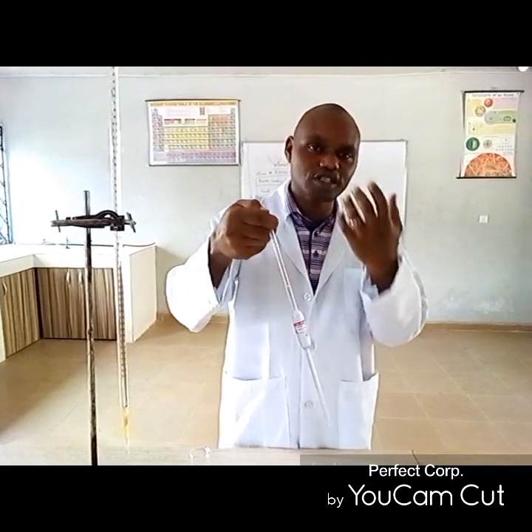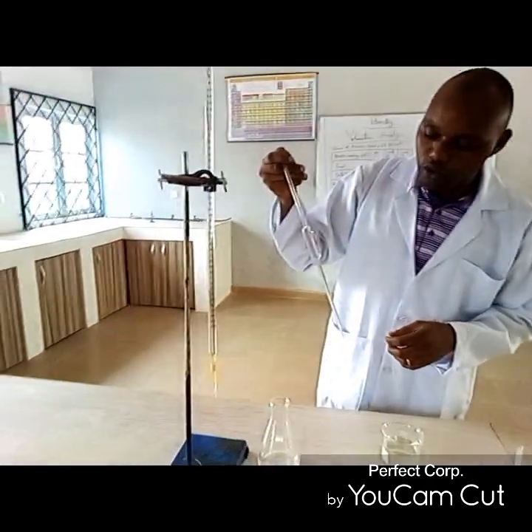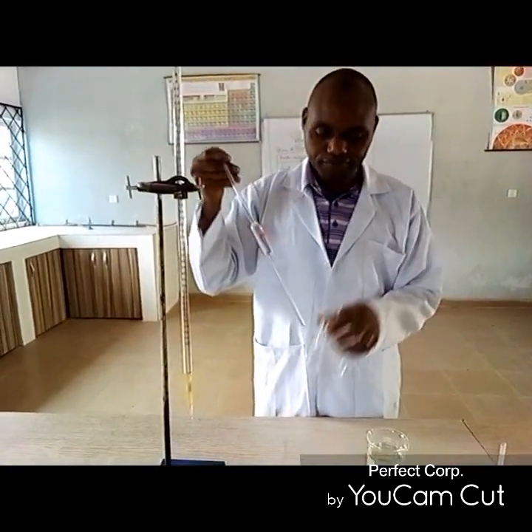Sometimes it's not very easy to sip the base like that to get to this point. Sometimes you need to allow it to pass through the meniscus level. You can go beyond it, then you know how to adjust it to that point. For some chemistry students, sometimes they even touch their tongue. So in cases like that, when it happens, immediately you need to use distilled water to rinse your mouth. So this is it. Now we are going to put the base in the conical flask.